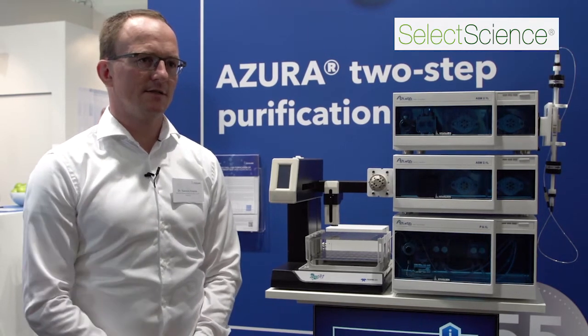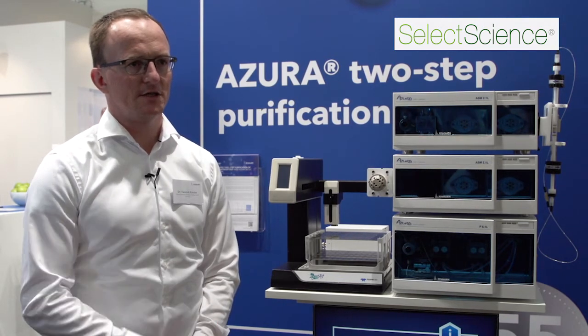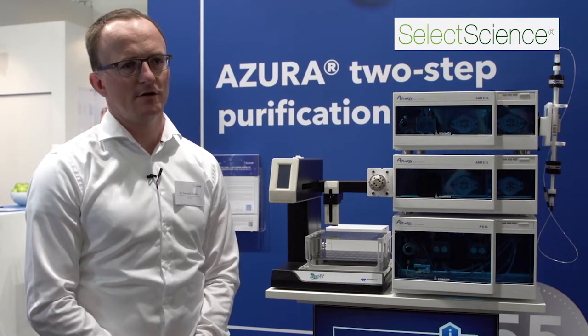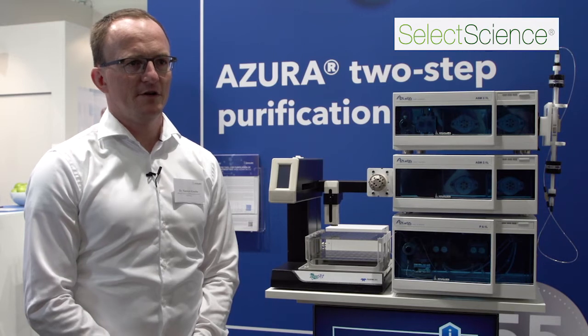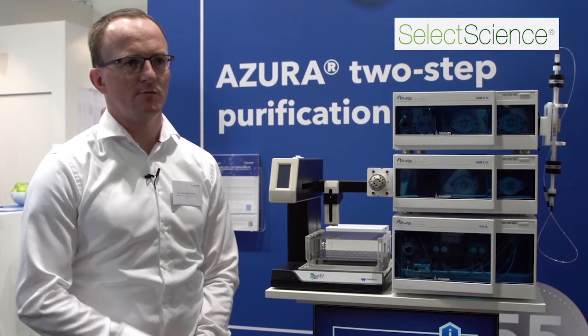Another assistant has a UV detector and also two other injection valves for special operations. Besides, we have also a so-called column switching valve which enables the use of two or more columns one after another.